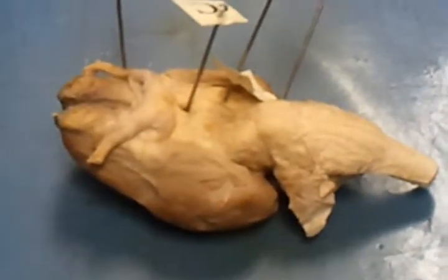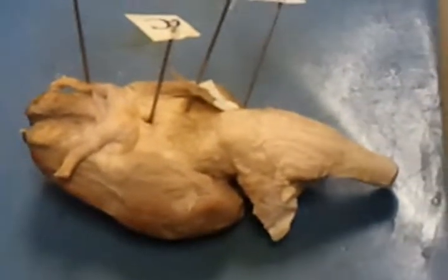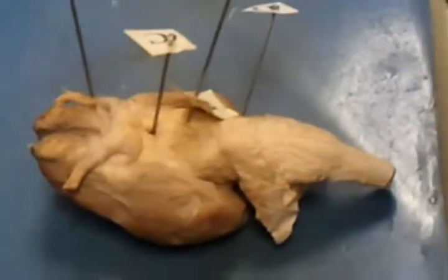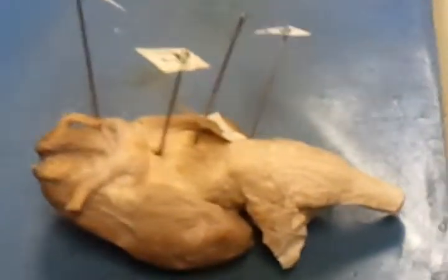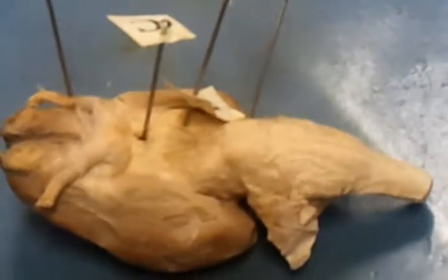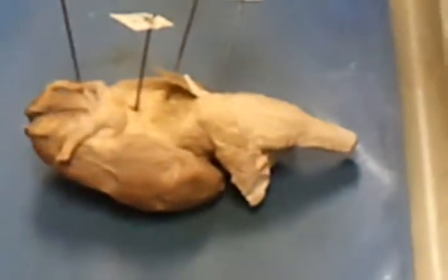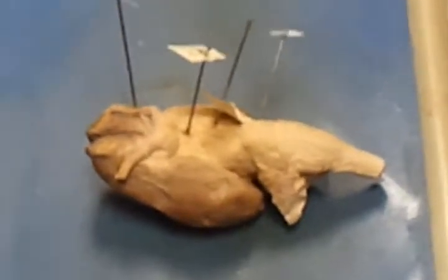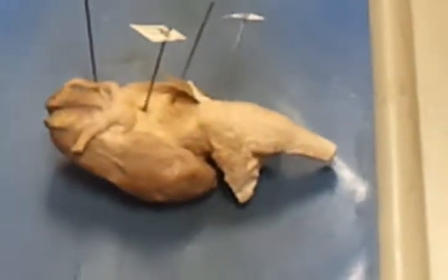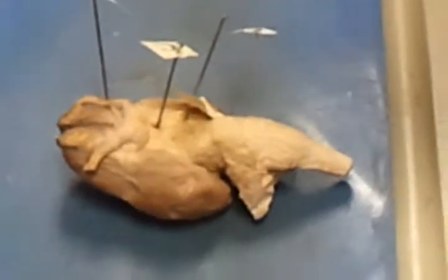You guys know what those nerves are? They're the obvious ones. When we did this, I said those are ridiculously obvious. Oculomotor. Sorry, oculomotor. All right. The way you can think about that is those big nerves that you see right below either the infundibulum or immediately behind the optic nerves. Optic, ocular, little association. Okay, C we've had before. Infundibulum. Right. And there's a certain type of gland that hooks up to that. Hypophysis. Yep.